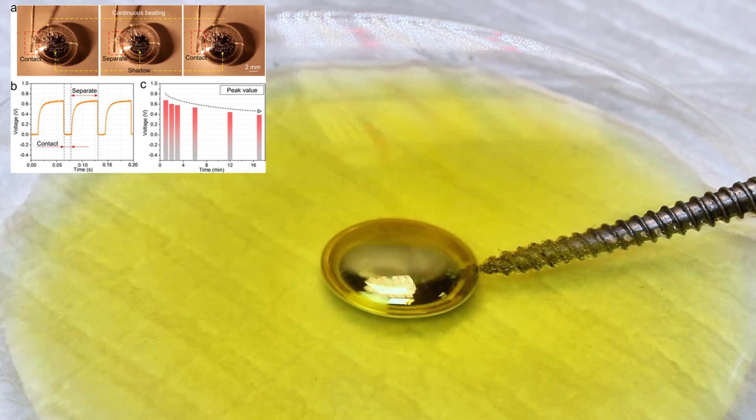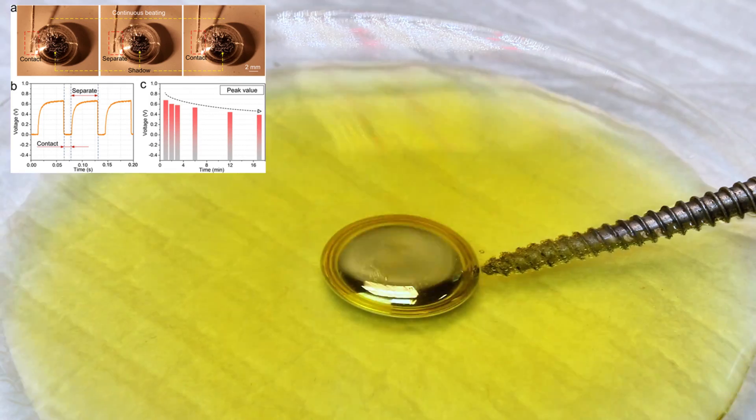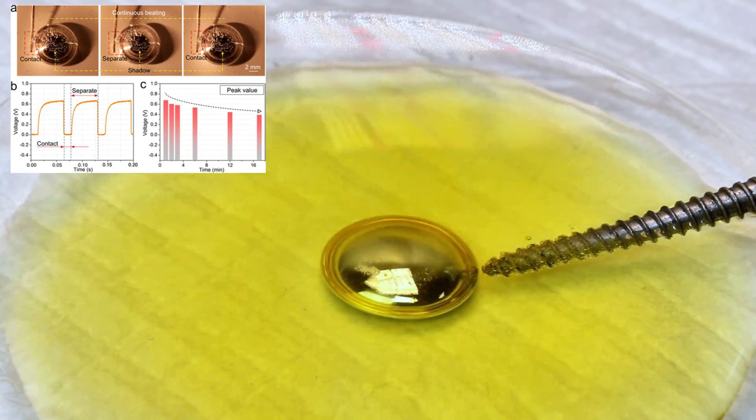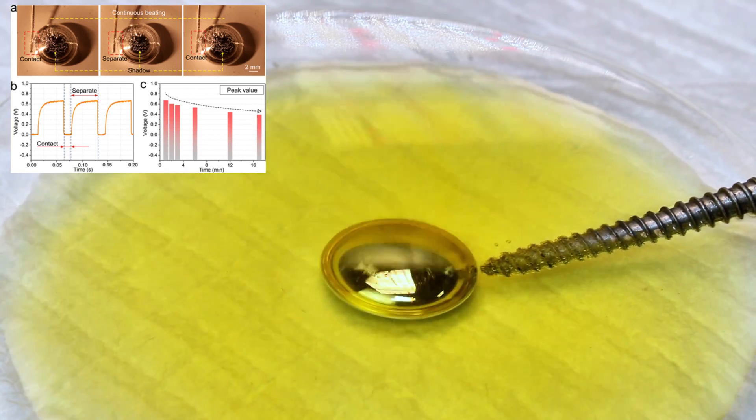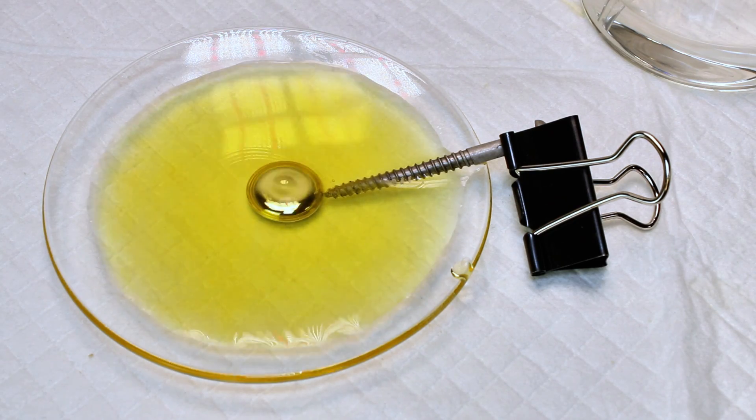Since the blob gets taller when it's reduced and wider when it's oxidized, the nail can be positioned just right so that it barely touches the mercury when it flattens, and separates when it balls up. This repeats in a reciprocating redox series that causes the beating oscillations.